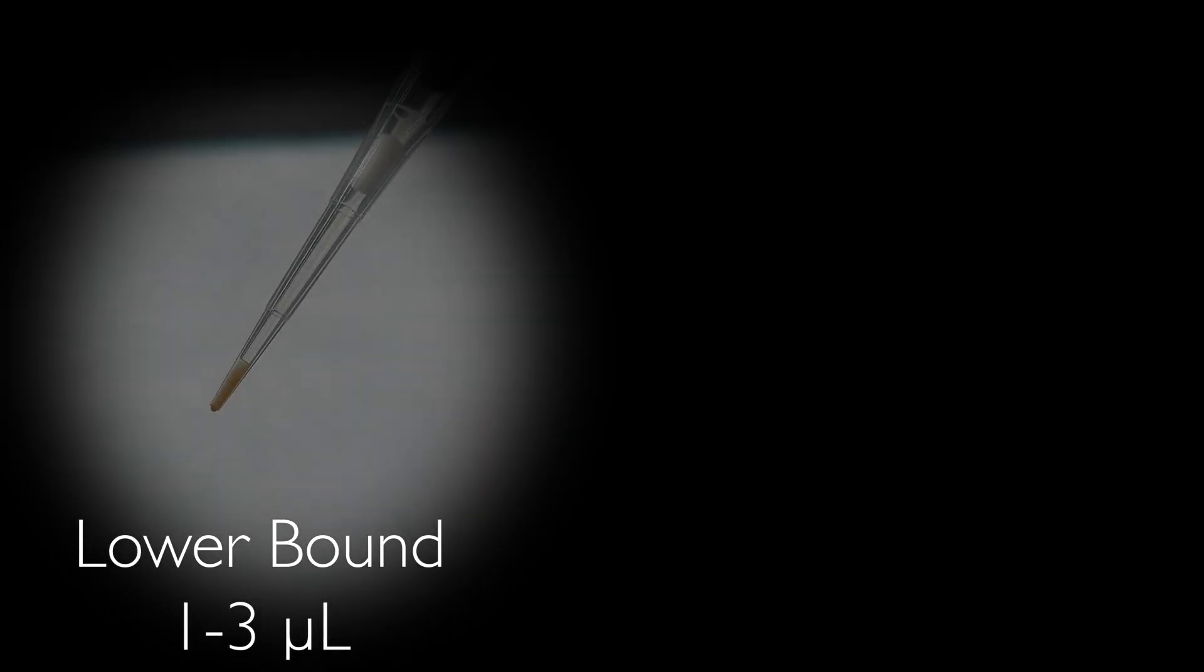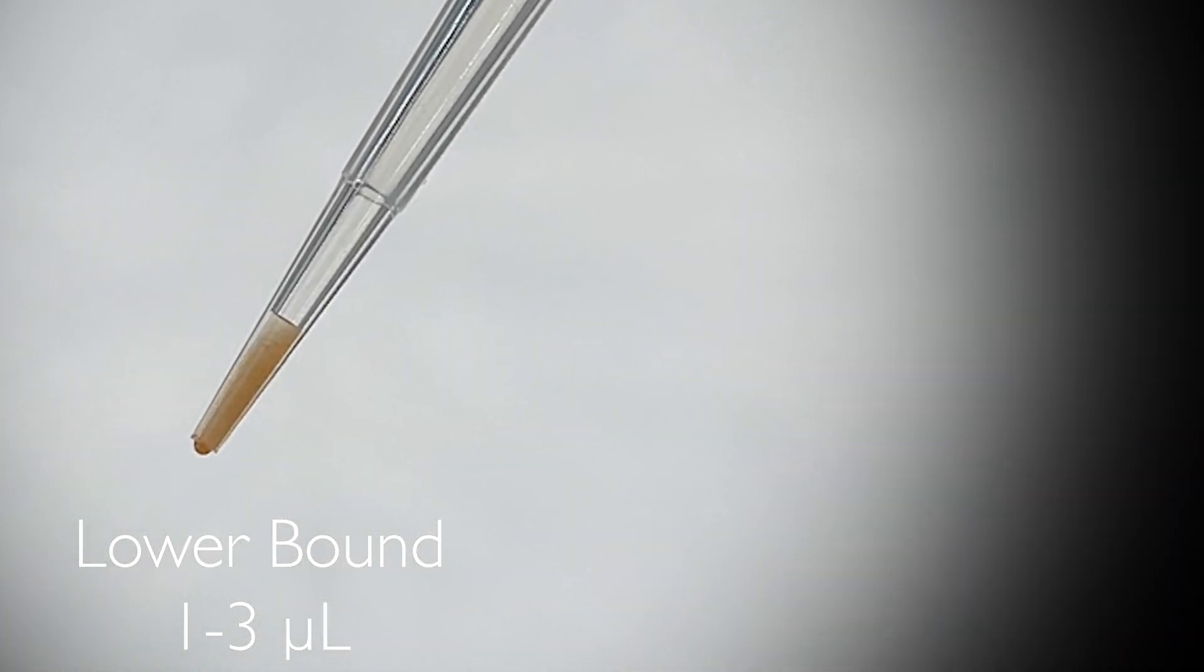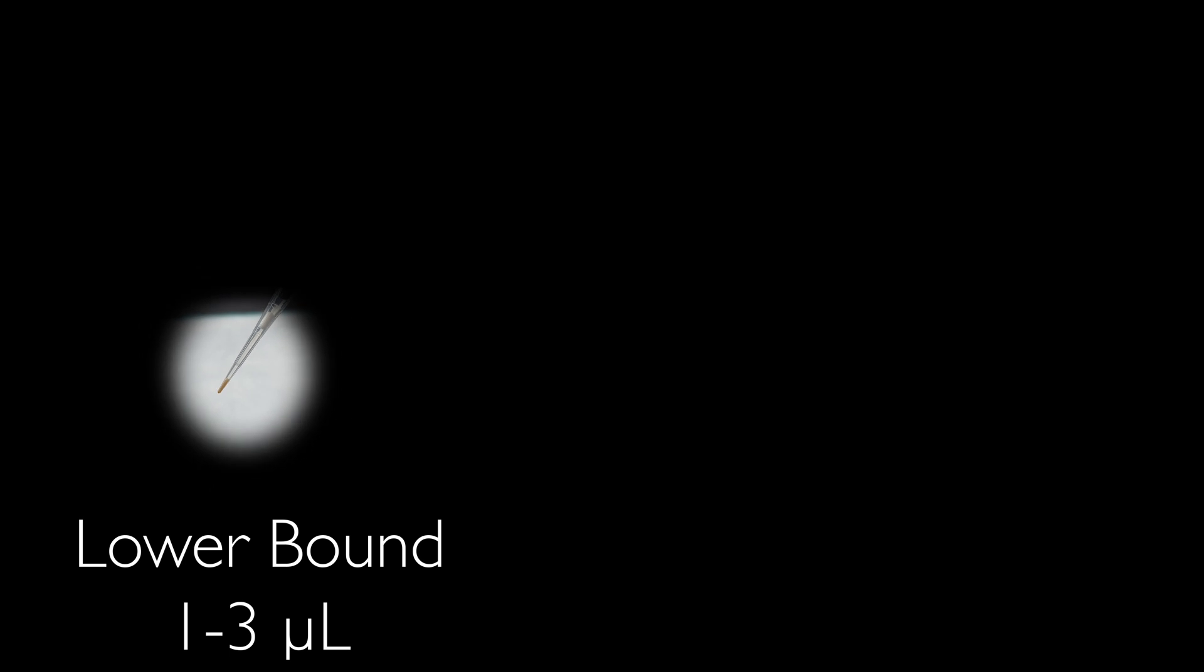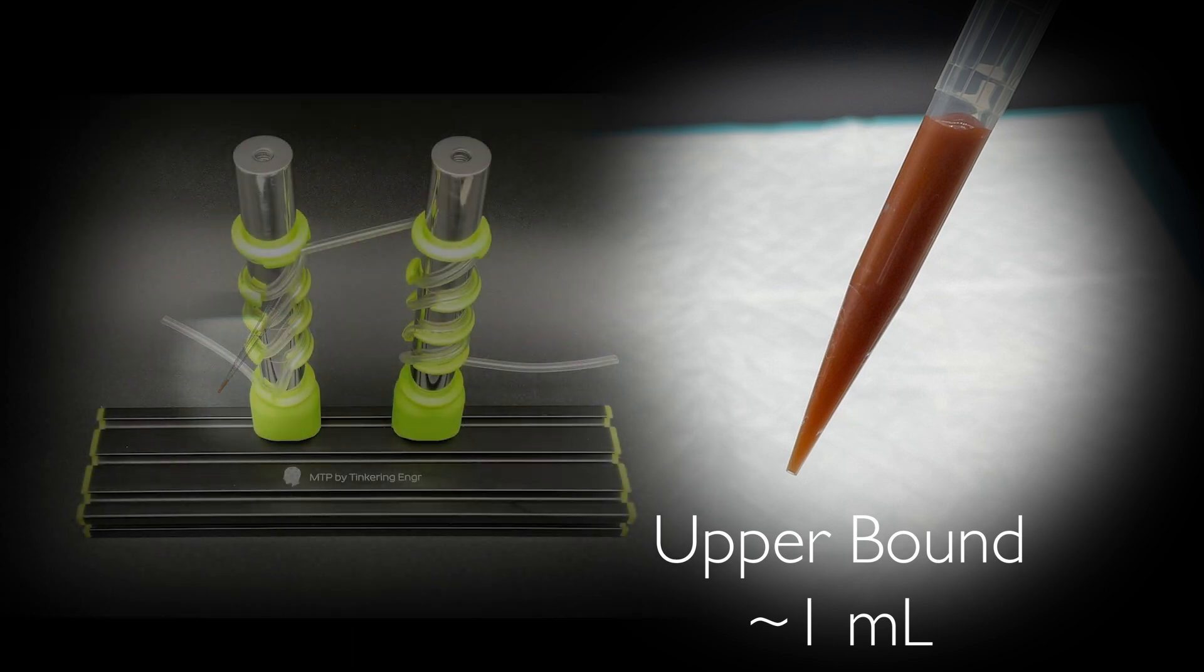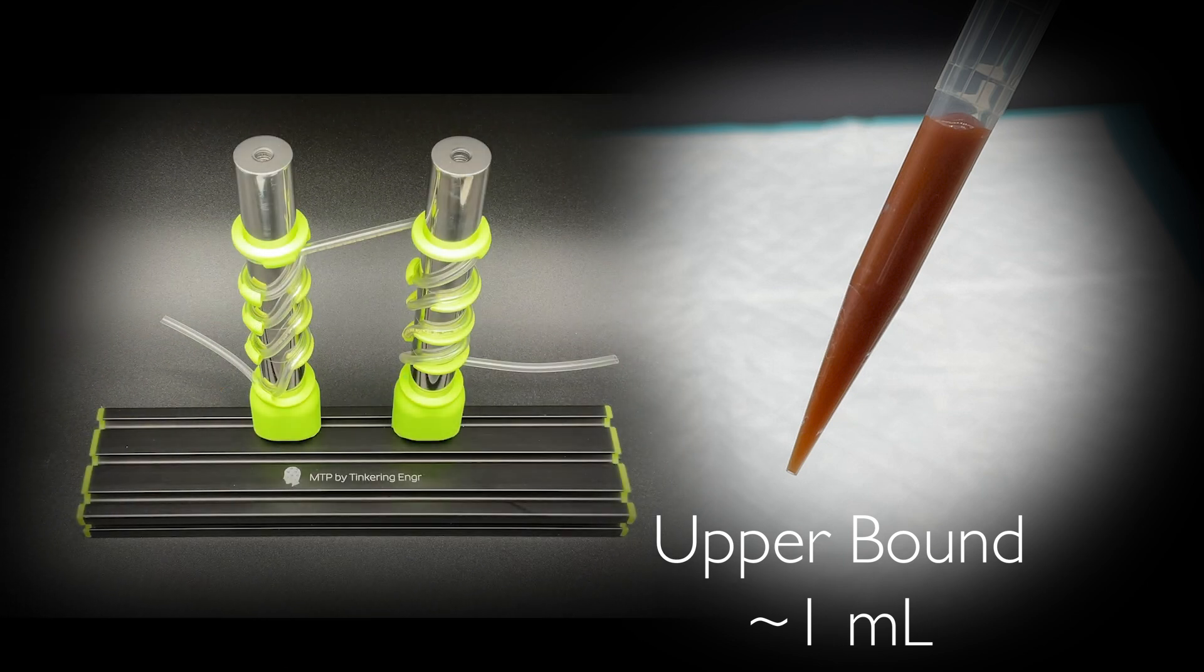But for the lower bound, you probably wouldn't want to go below a few microliters due to the difficulty of just seeing the resin. And for the upper bound, depending on the resin, I've tested less than one milliliter of resin before the magnetic trap becomes saturated. You can always add more magnetic traps in series if you need to do larger purifications.